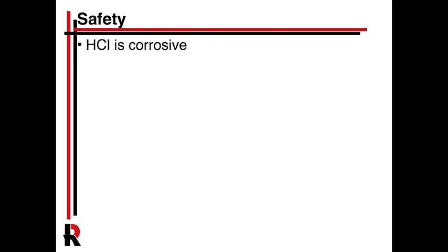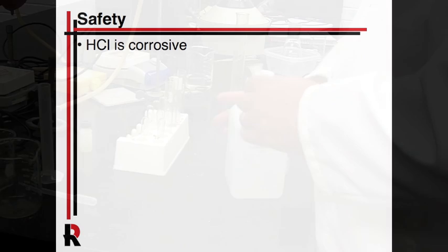And from a safety standpoint, the real key issue is that HCl, especially, is corrosive. All these acids are slightly corrosive, especially at the higher concentration, so you want to wear gloves and be careful. So the key here is properly doing it.